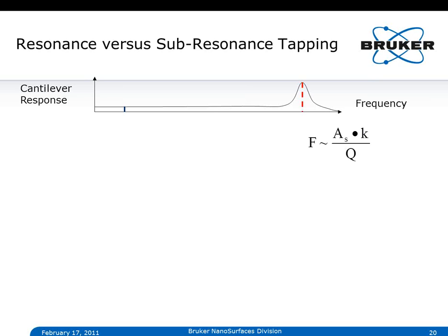So we start with a free amplitude of X nanometer, and then say we want to have it reduced to Y nanometer. So that difference is basically one of the factors that determines our actual force. And then of course it's dependent on the spring constant, and we just established that we need a quite stiff tip, so a high K to avoid that jump into contact.